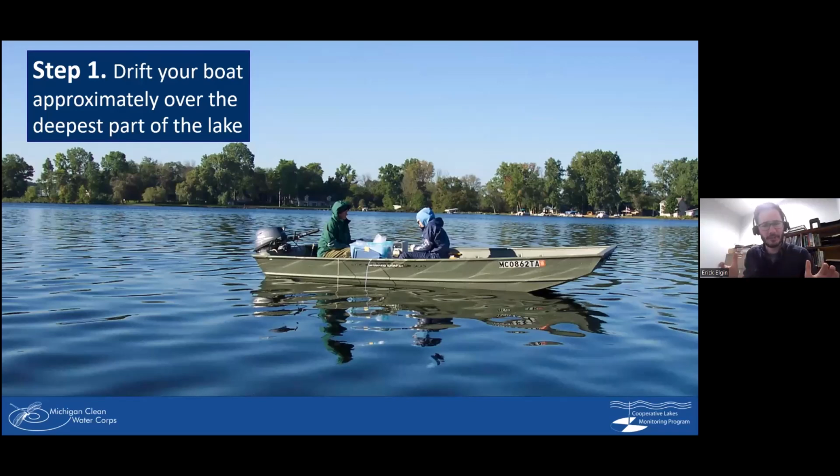If it is a very stable, not windy day, you do not need to anchor if you don't want to. If your lake is really clear and there is a little bit of wind, you do want to be pretty stationary, because you can be pushed a little bit, and now your Secchi disk is actually trailing behind you, which would not give you an accurate measurement. So being stationary is very important for this.